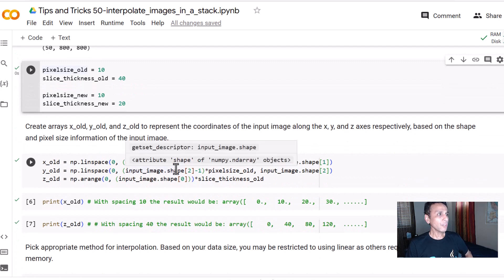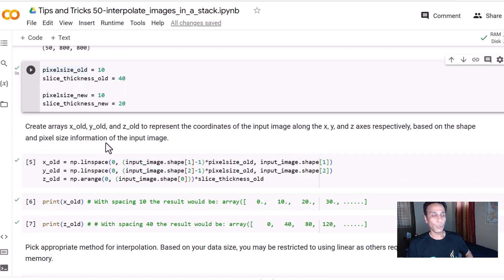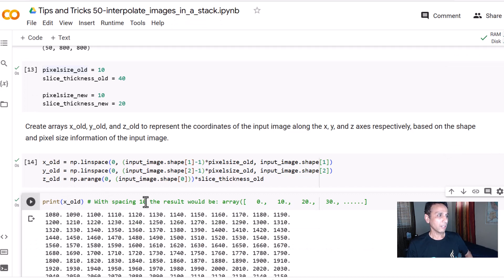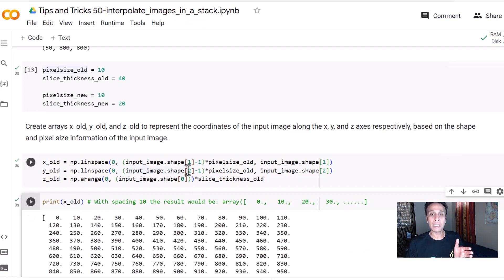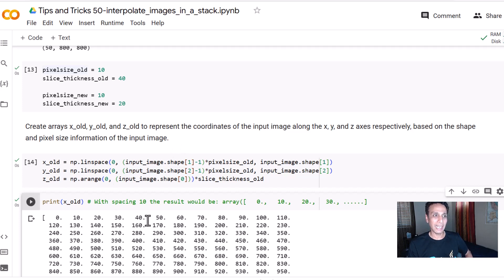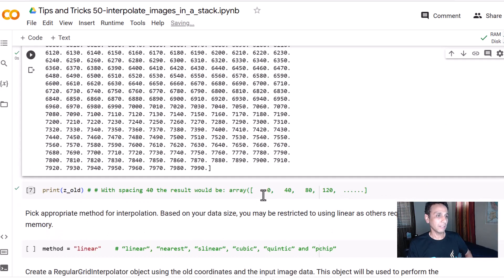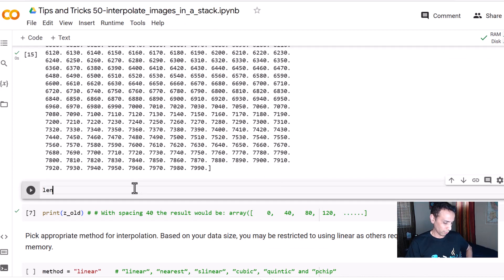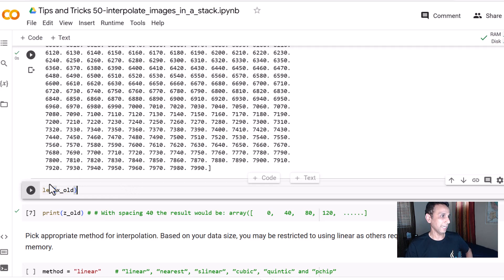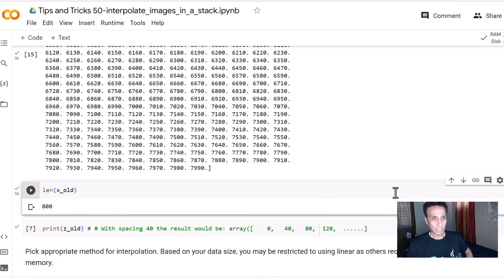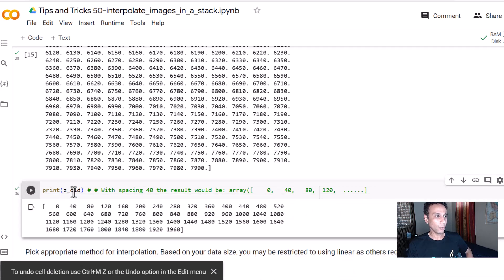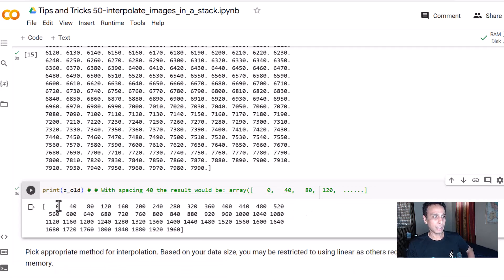The first step is to create an array of your old coordinates. When we print x_old, it's nothing but 0, 10, 20, 30, 40, 50, 60 — because our pixel spacing is 10 nanometers. We should have 800 of these because our pixel size is 800 by 800. For z_old we have 50 values with a spacing of 40 nanometers.